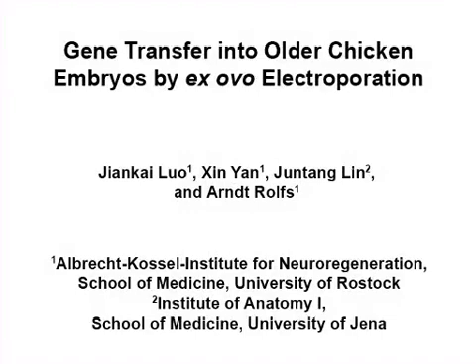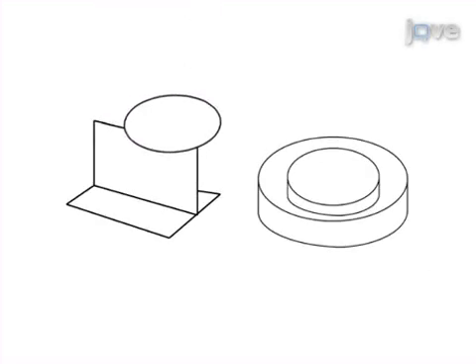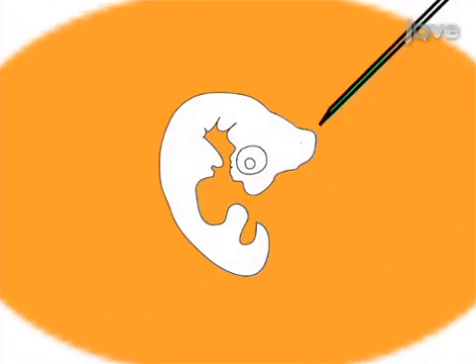The overall goal of this procedure is to perform gene transfer into older chicken embryos in vivo to study gene function and regulation at older developmental stages. This is accomplished by first cracking an egg at about incubation day 2.5 and transferring the entire embryo into a petri dish system. The second step is to inject the plasmid encoding the gene of interest into the appropriate part of the embryo.